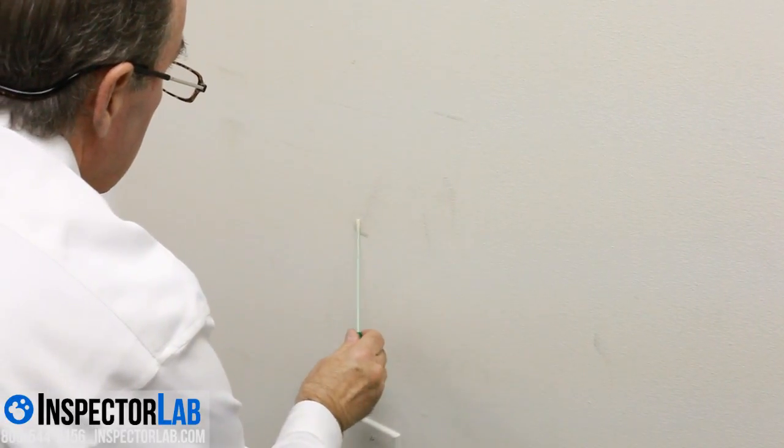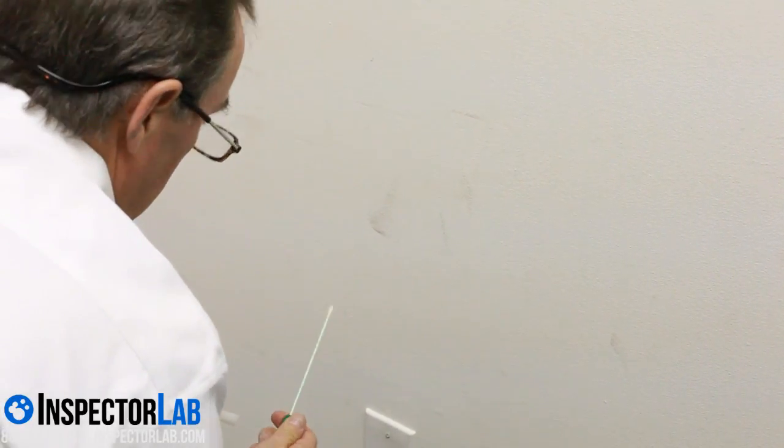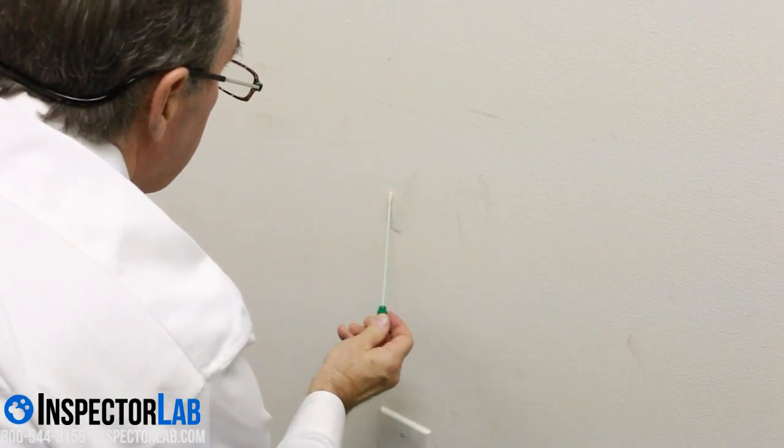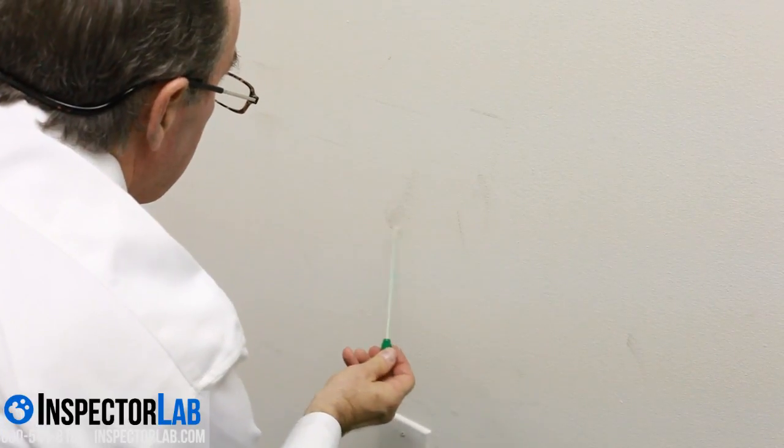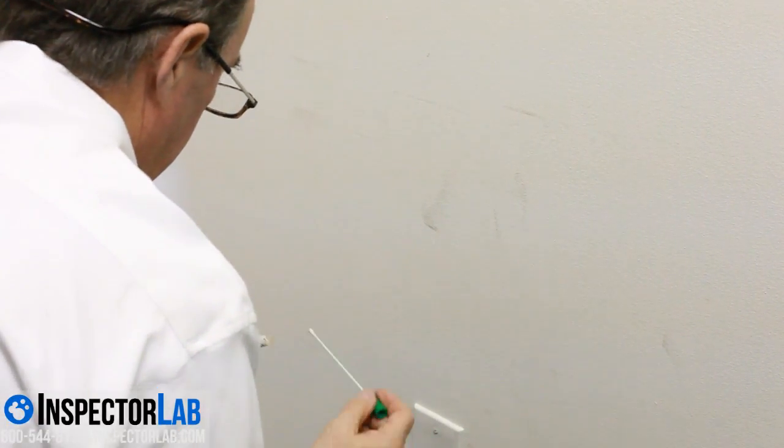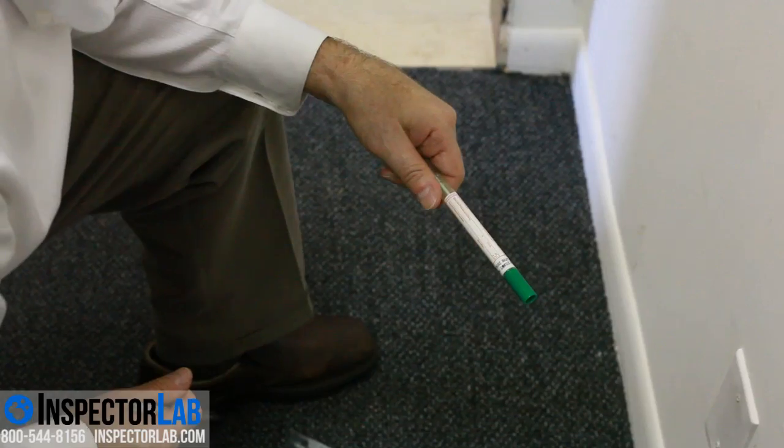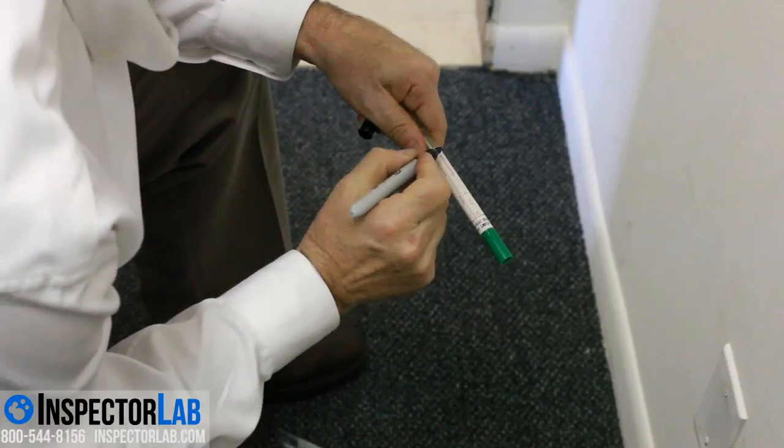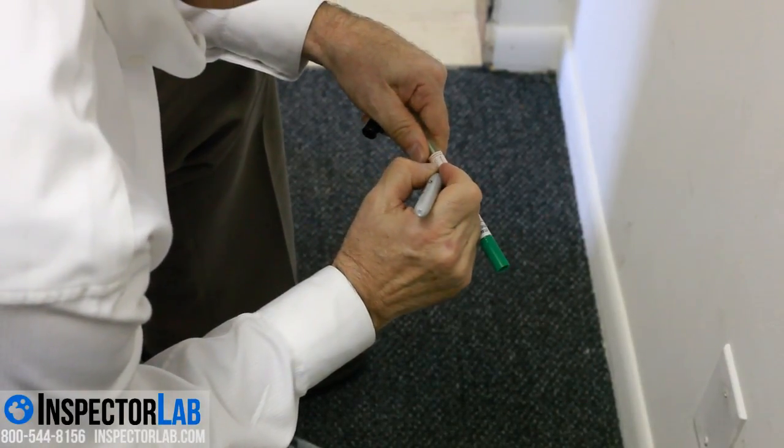Remove the swab from the package and sample the surface using a back and forth rubbing motion. It is helpful to rotate the swab in your fingers as you sample. After the sample is collected on the tip of the swab, carefully break the seal on the swab tube without touching the swab tip or placing the swab on any surfaces. Discard the swab tube cap and place the swab firmly into the sterile tube.